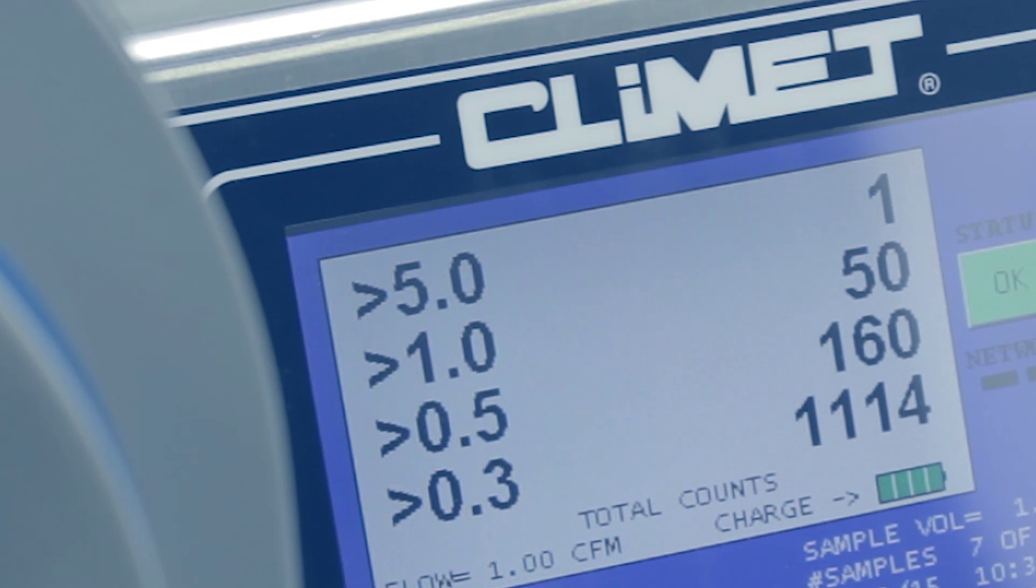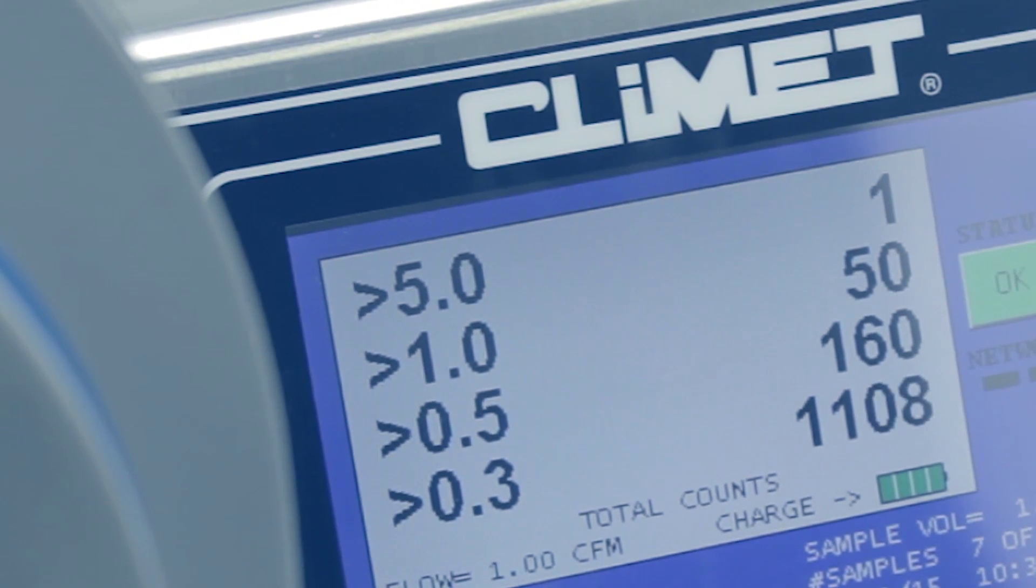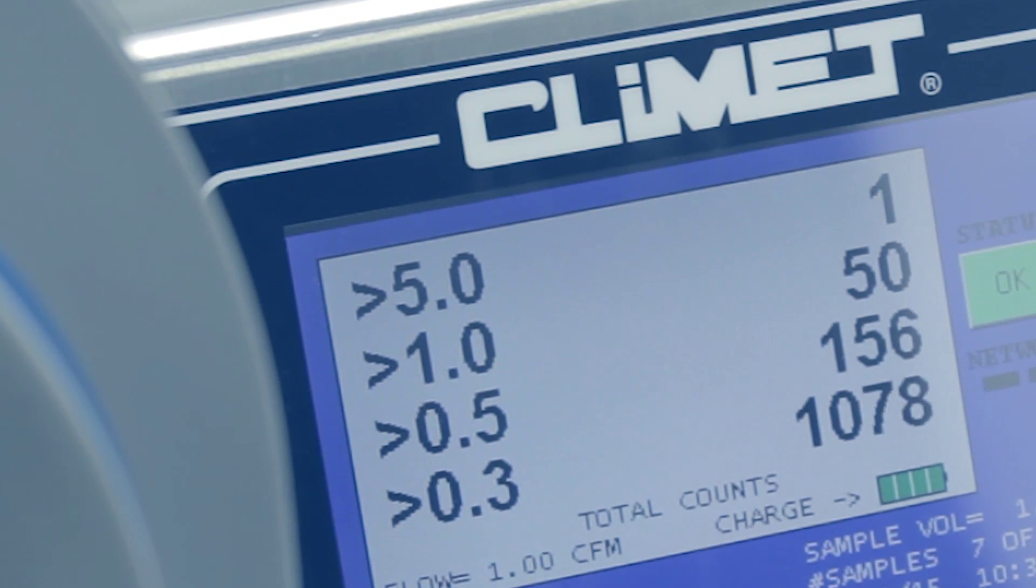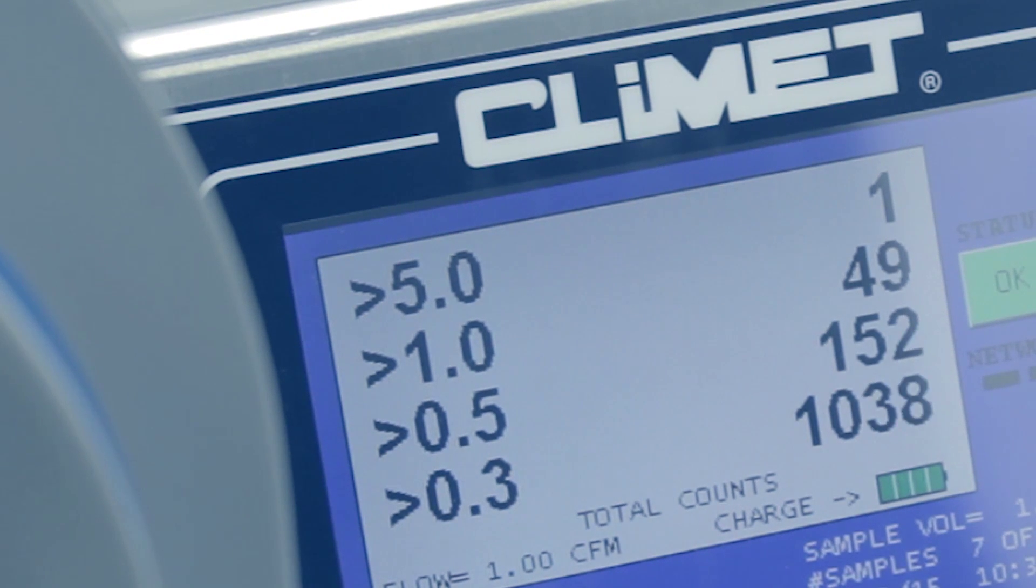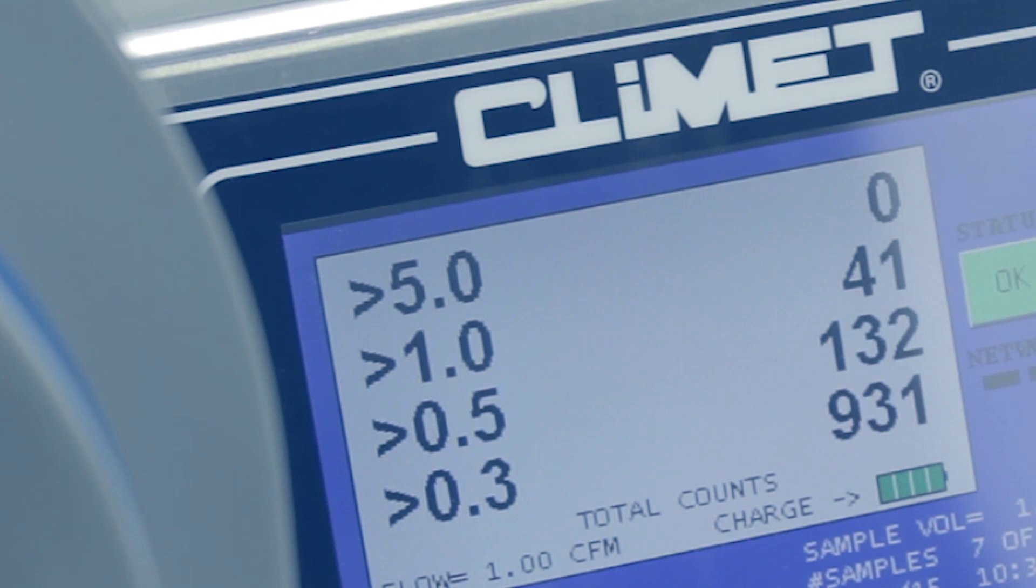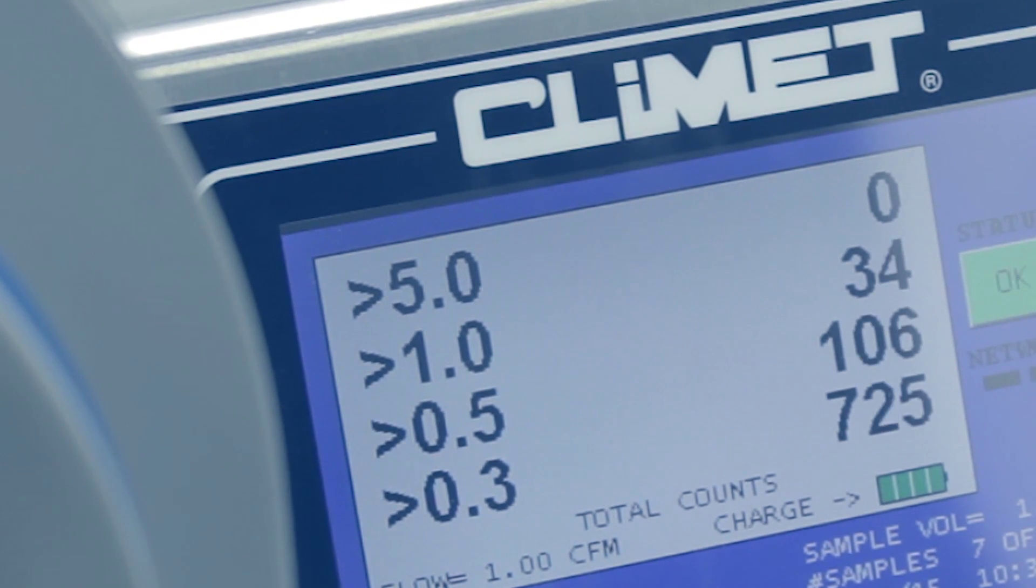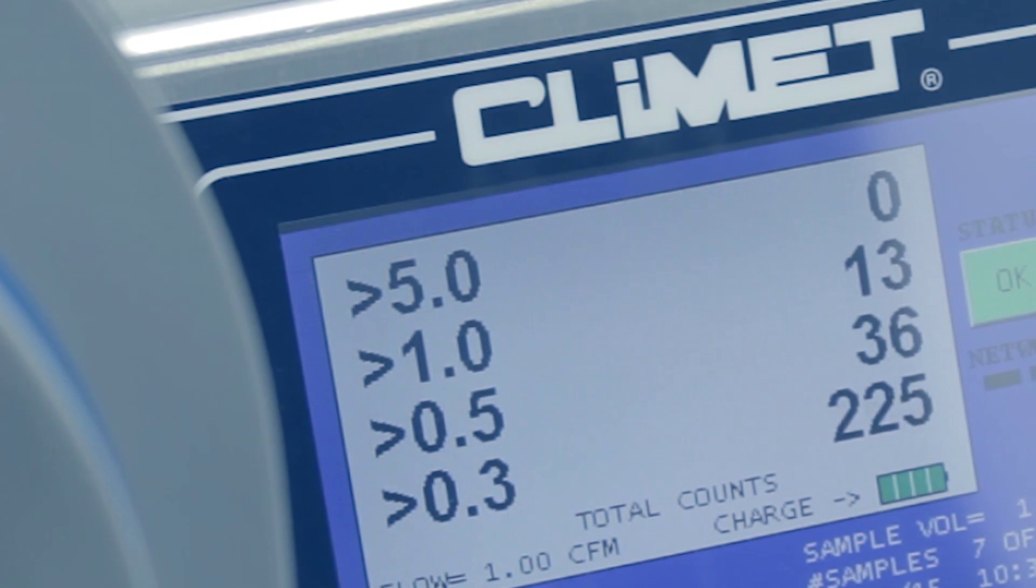You can see by the counter that on entering the workstation, particulate is introduced. However, if you keep an eye on the counter as the HEPA filter starts to work immediately, and don't forget that all the atmosphere is recirculated and passes through the filter continuously hundreds of times an hour, you can see that the particulate count is soon reduced to zero.